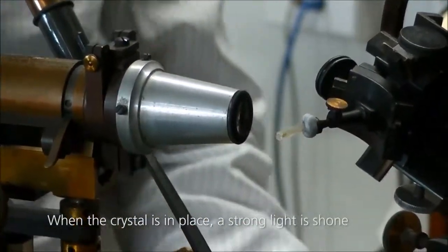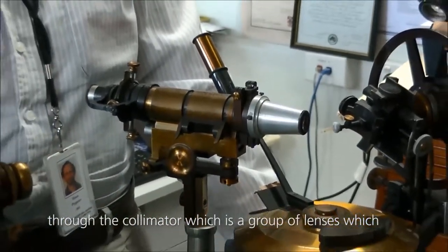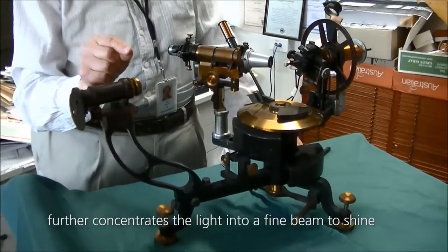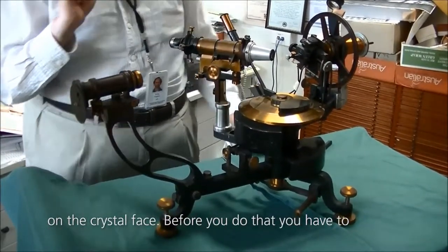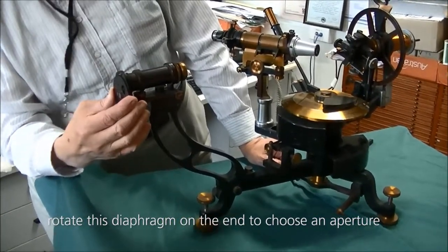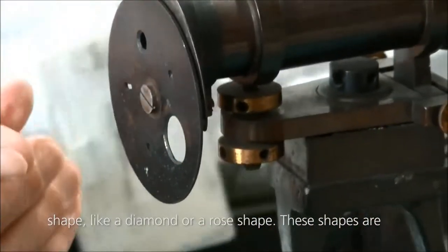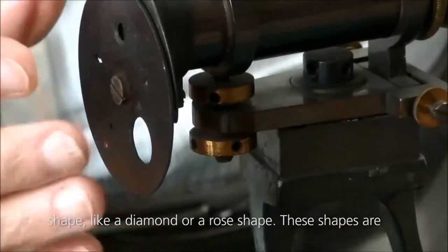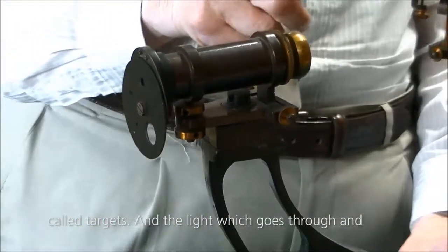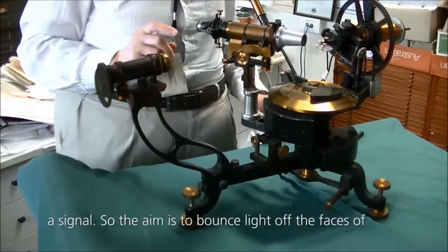When the crystal is in place, a strong light is shone through the collimator, which is a group of lenses that further concentrates the light into a fine beam to shine on the crystal face. Before you do that, you have to rotate this diaphragm on the end to choose an aperture shape, like a diamond or a rose shape. These shapes are called targets, and the light which goes through and hits the crystal will have a pattern to it, and that's called the signal.